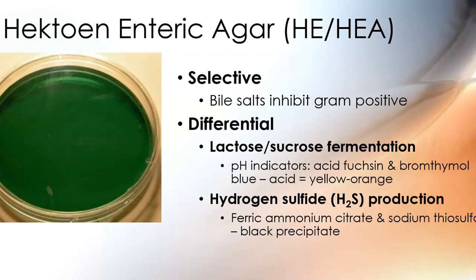Hektoen enteric agar will also show us H2S producers. Now, nobody had any black centers in their colonies today, right? I didn't think so. It's still too young. Typically, the Proteus vulgaris takes the 48 hours of incubation to show the H2S production. Plus the fact that it's still a young culture. It's only technically 2 days old.